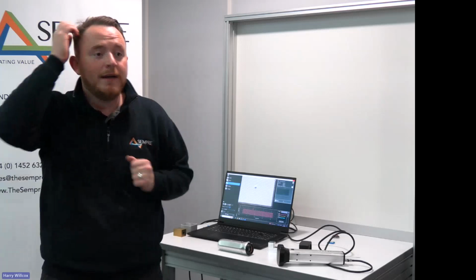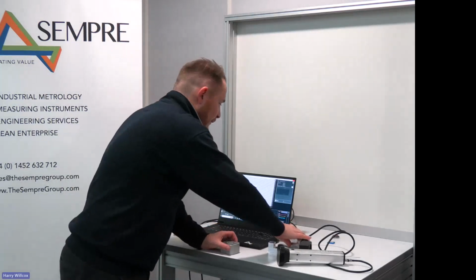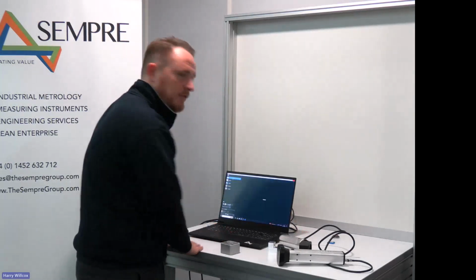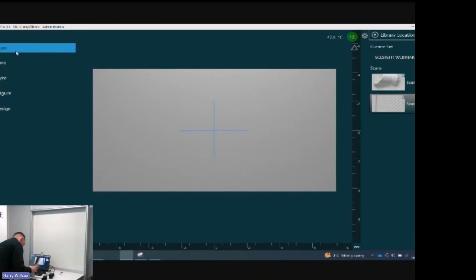So it depends, but we try to aim for a 1-to-1 scale, with the mark being 1-to-1 as a minimum of depth to width. I can show an example of that and how easy it is to understand when you've not hit the bottom of a mark. If we jump to the software, I've got a component here that's effectively a through hole, but the aim is to show you the principle of how, as an operator, you can understand when you've not hit the bottom of a component.